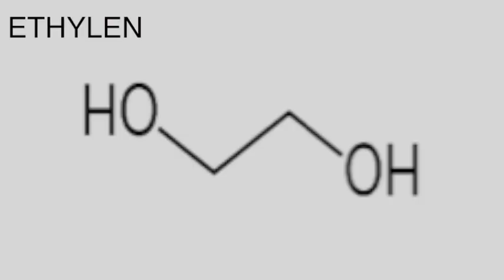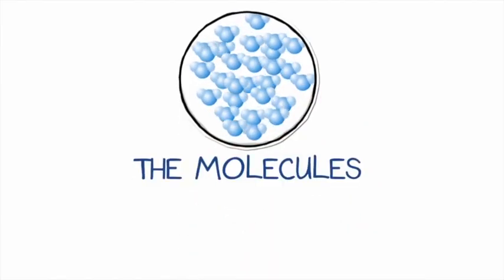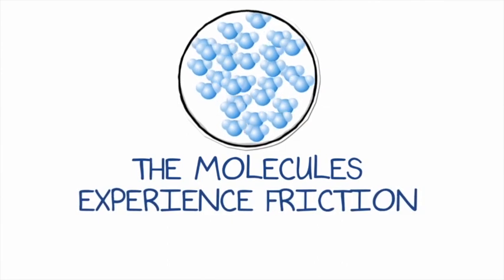It is known that the tighter the molecules are made, the more resistive it is to deformation. From the samples, ethylene glycol is the most viscous, for it has two ends capable of hydrogen bonding. Hydrocarbons with a longer carbon chain exhibit higher viscosity than the ones with shorter carbon chains. High viscosity in this case is influenced by greater surface area.